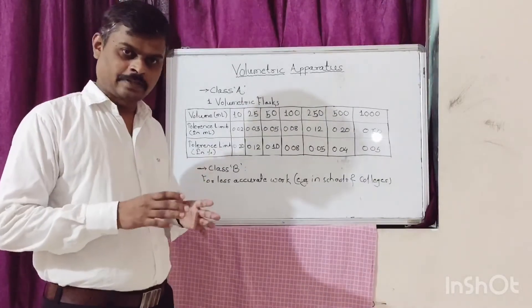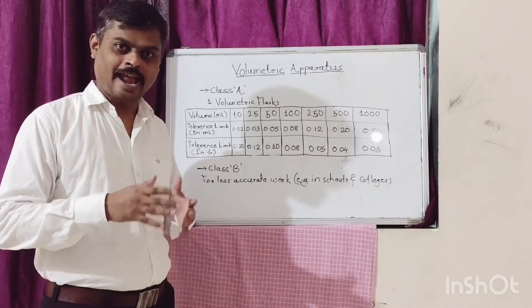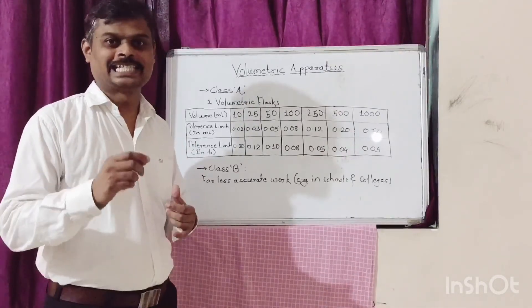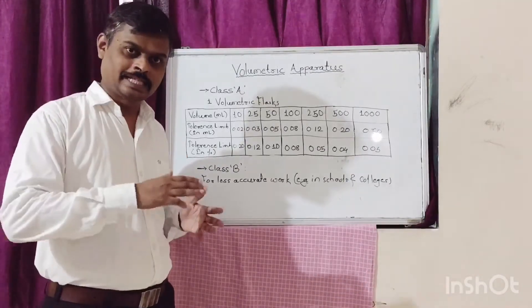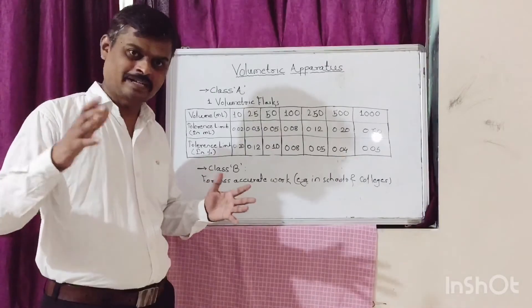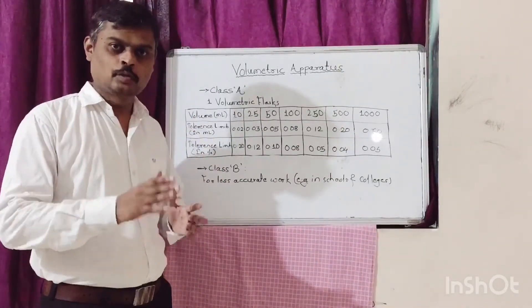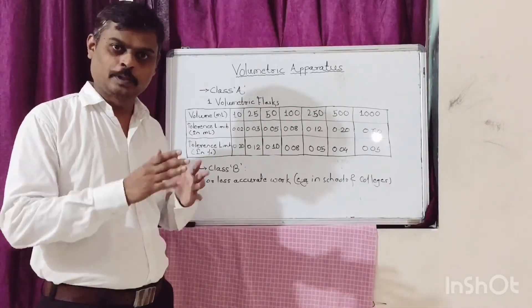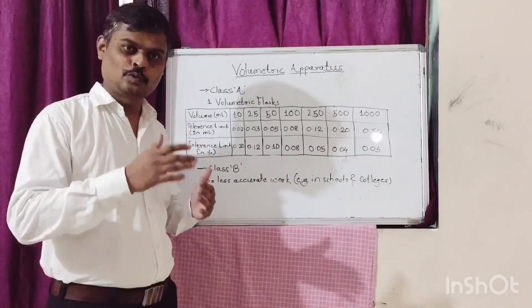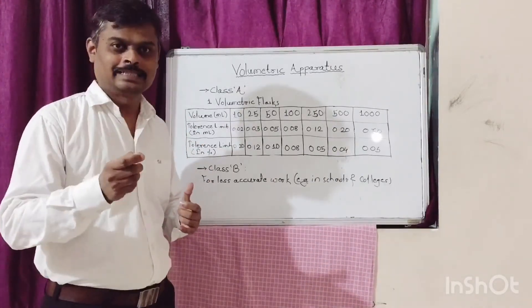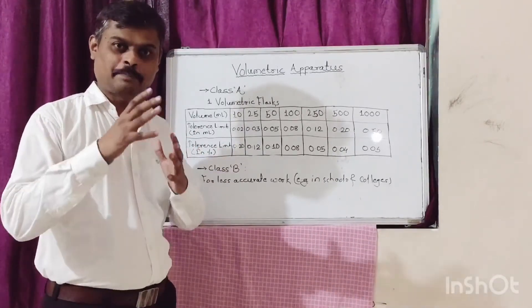Glassware or volumetric apparatus should be dried at or below 60 degrees Celsius. Because at higher temperatures, there is a tendency for glass to expand. Hence, drying above 60 degrees Celsius may cause expansion of the glass, which can disturb the calibration of the volumetric apparatus.